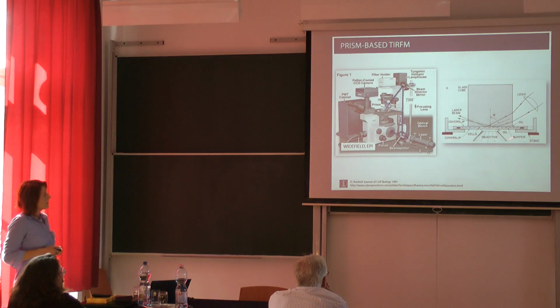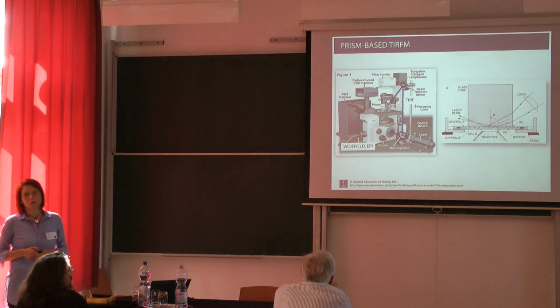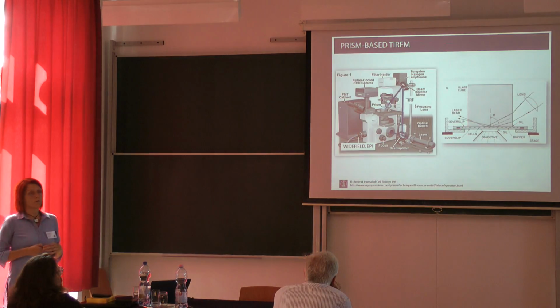So in this setup, what you cannot do is manipulate the sample in the experiment. That's one disadvantage of the prism-based TIRF system: you cannot change the composition of the sample.